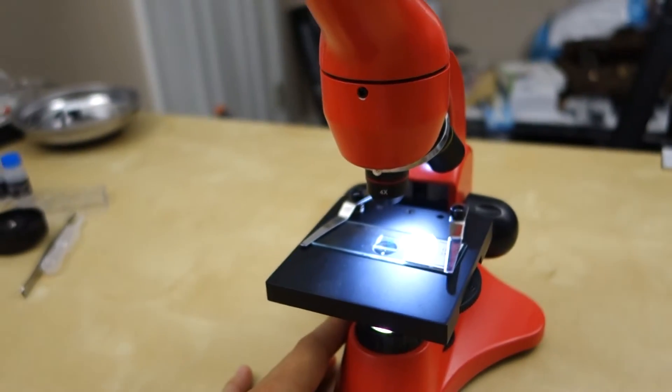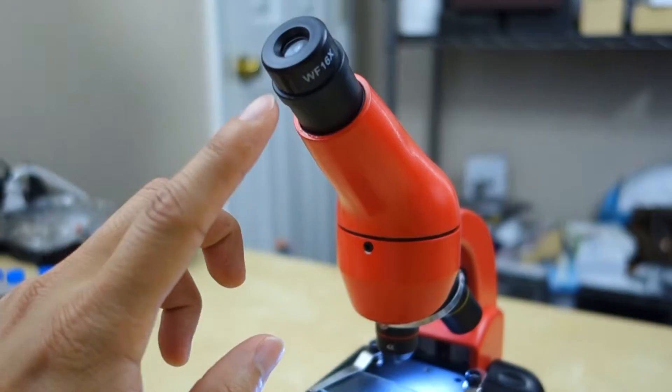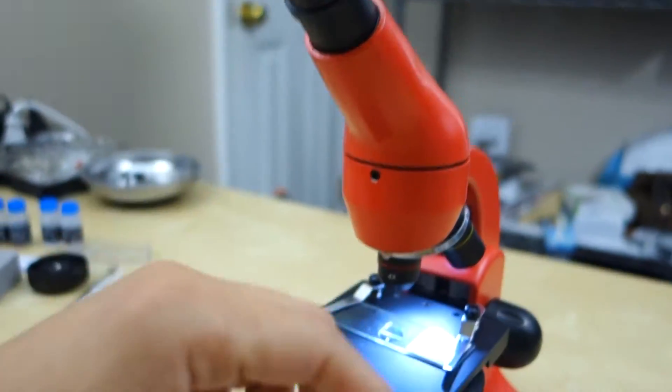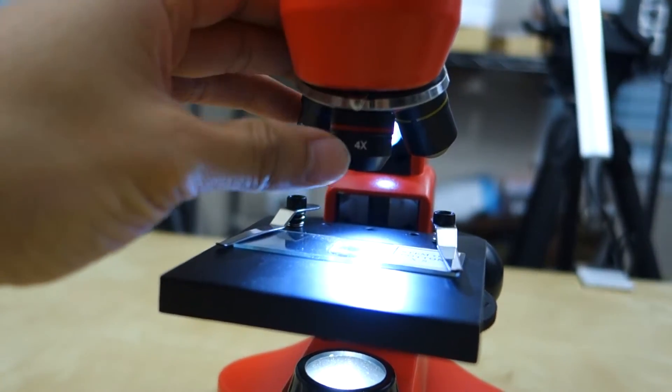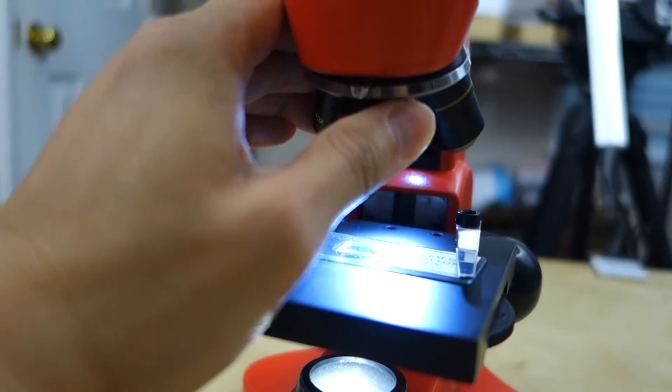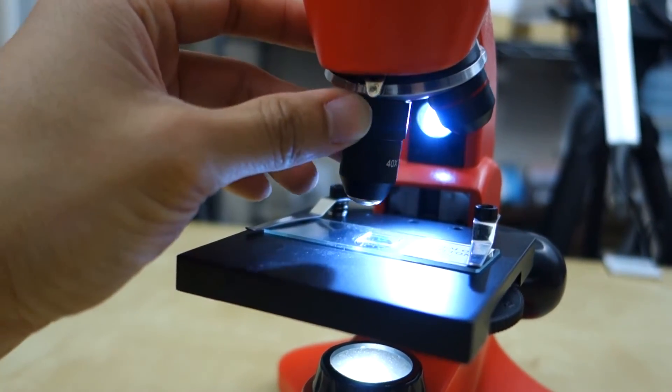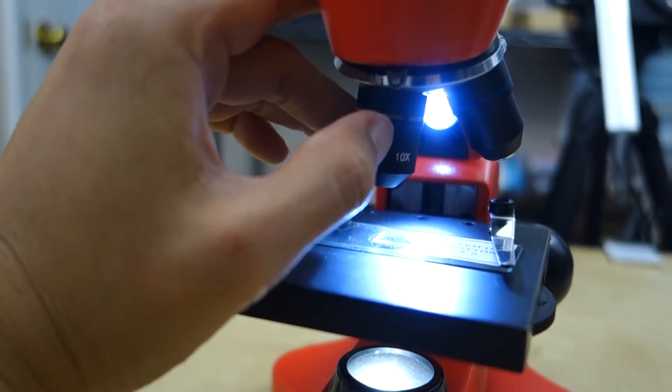So here's the unit as you can see. So you have the eyepiece up here with a barrel. Here you can see it's a 16x eyepiece. So here you have three adjustments. This is 4x. And then you can rotate it this way. 40x. And then again, this is 10x.